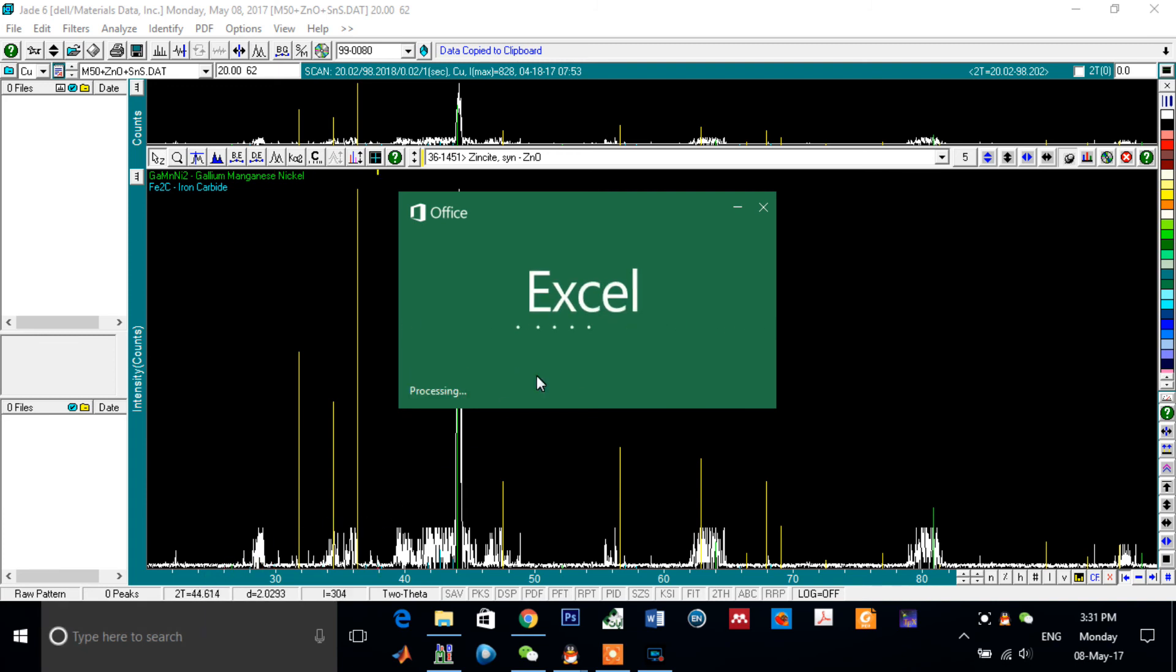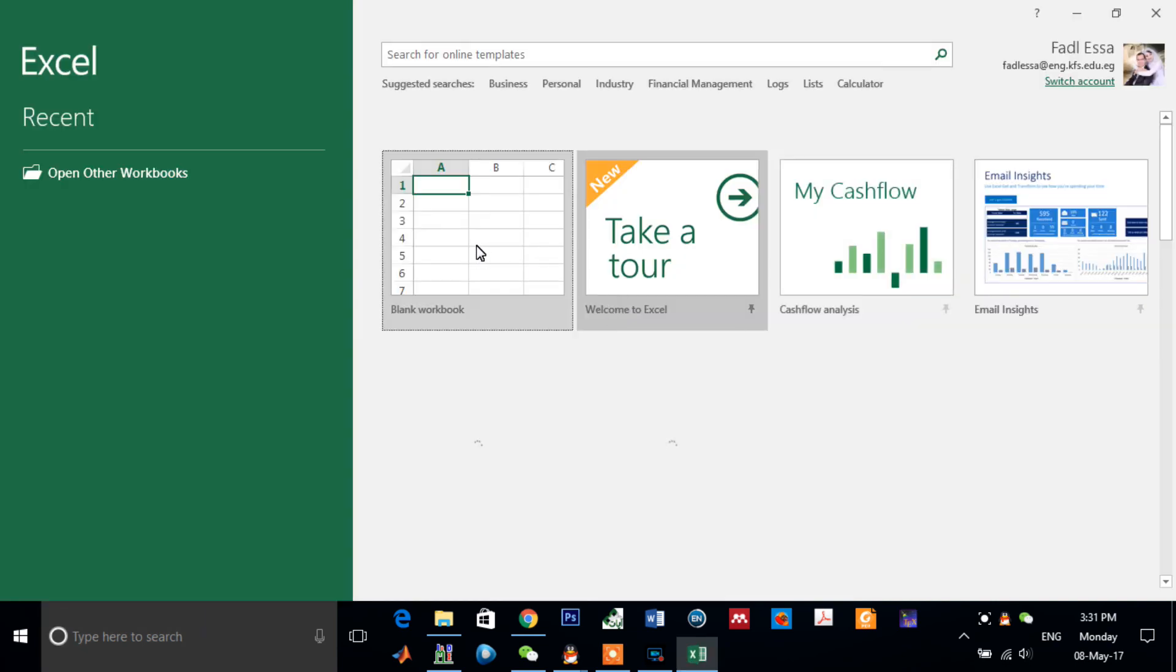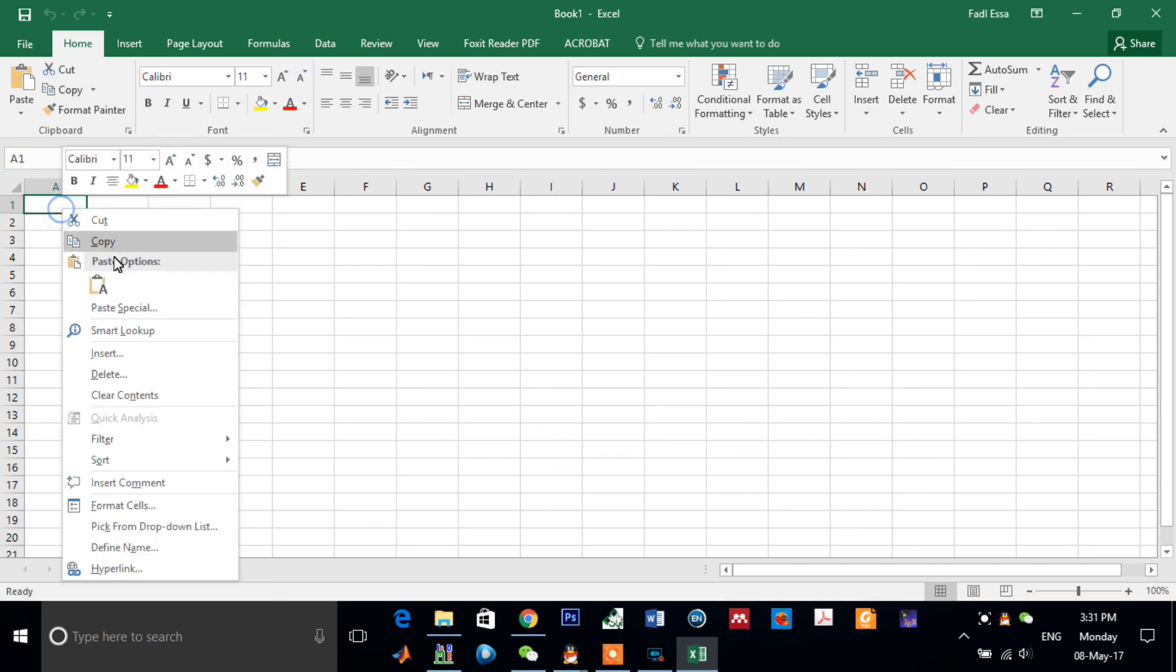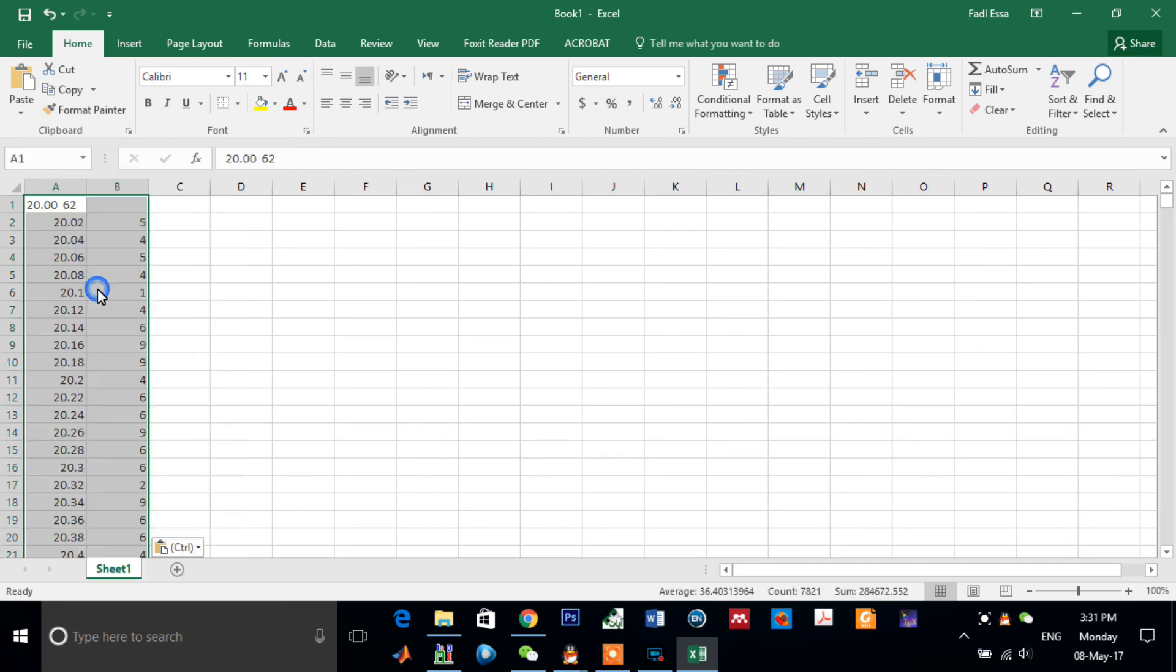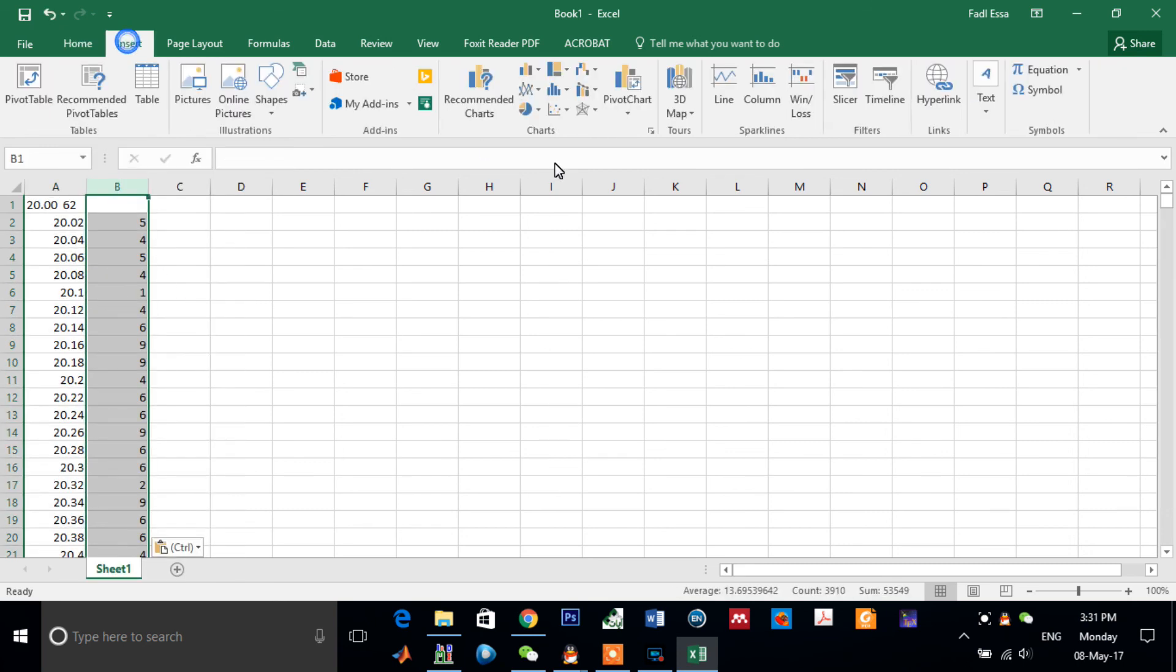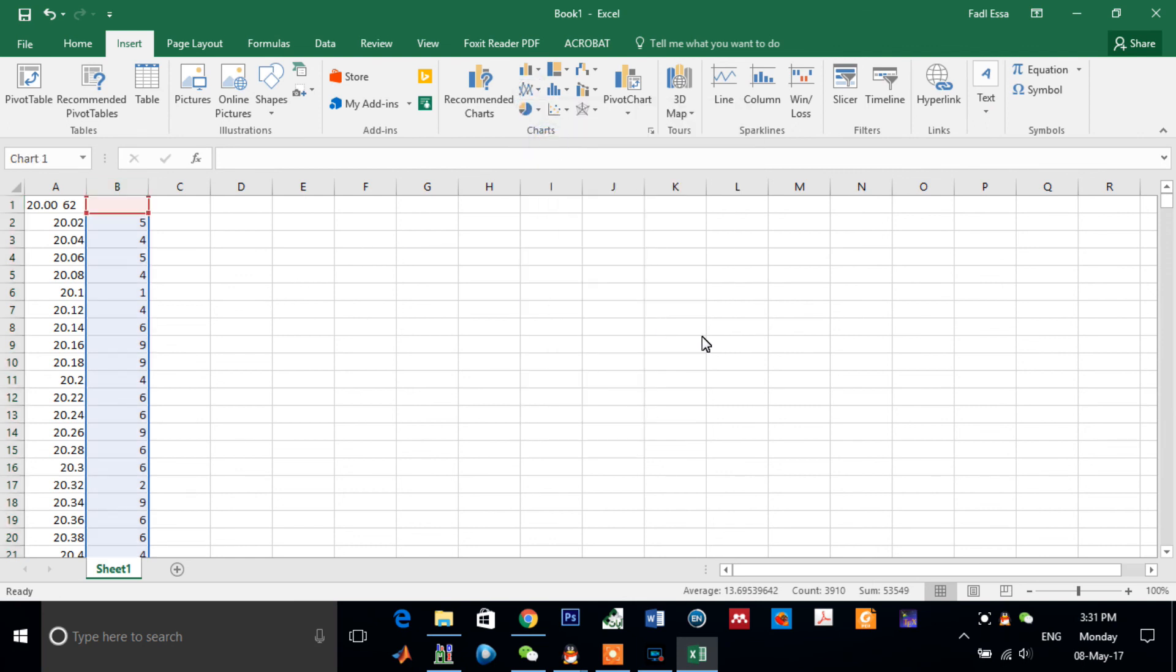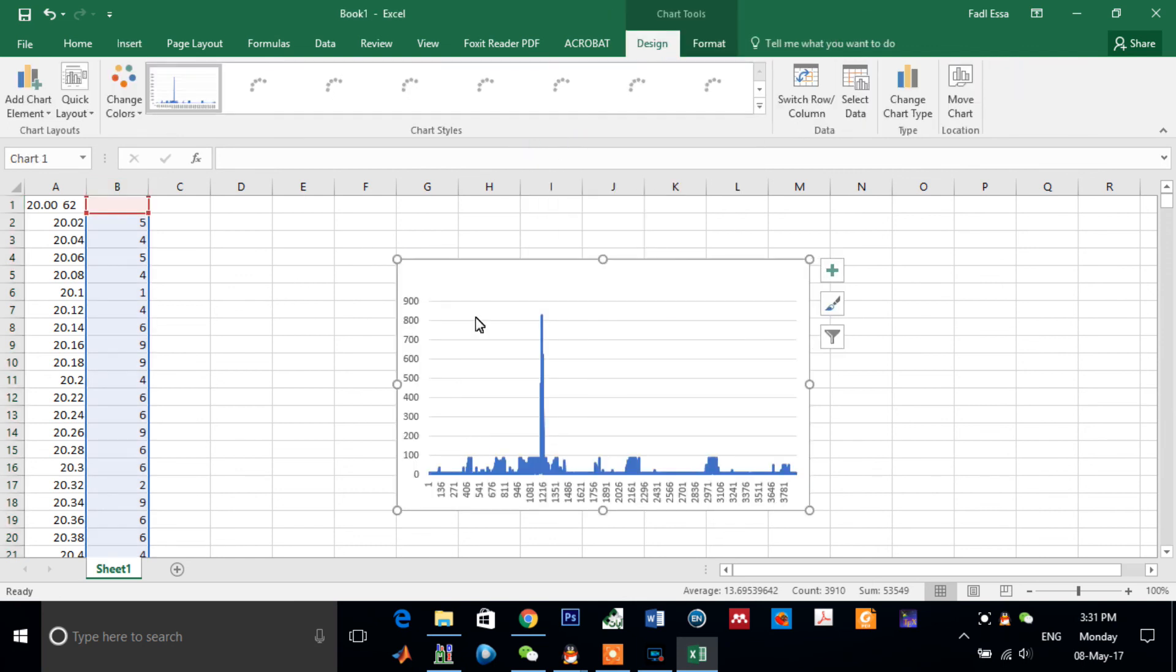And just paste your sample, the data of your sample here. Now you can draw it. Okay, as you see.